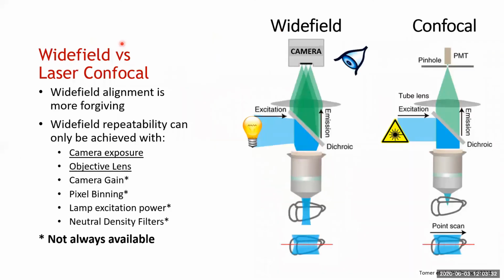The last thing I want to talk about is just a comparison of wide field. So I talked a lot about confocal laser microscopy. Now, in confocal or laser confocal, there are a lot of parameters that you can play with, from the laser power, of course, the filter sets. You can play with the pinhole, you can play with the PMT or the detector gain.